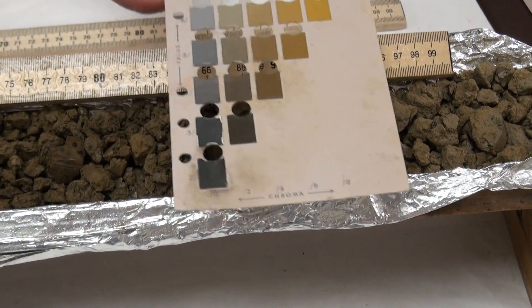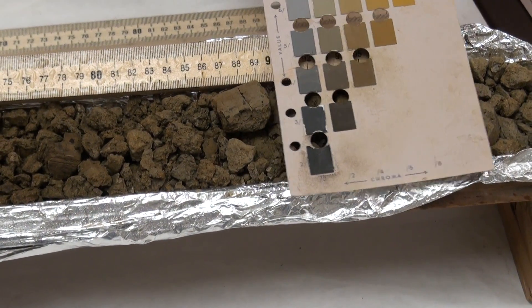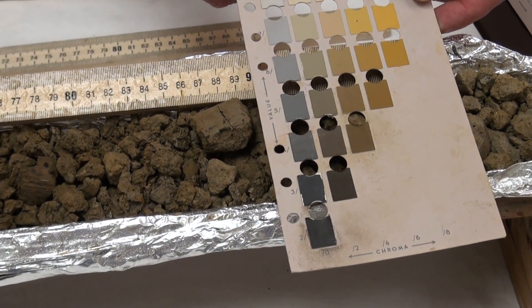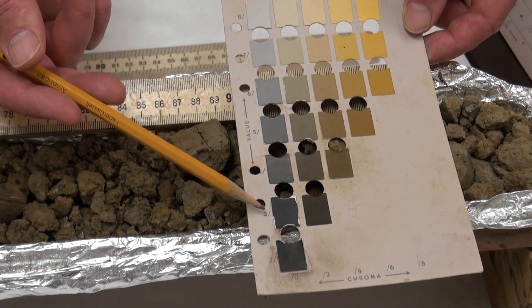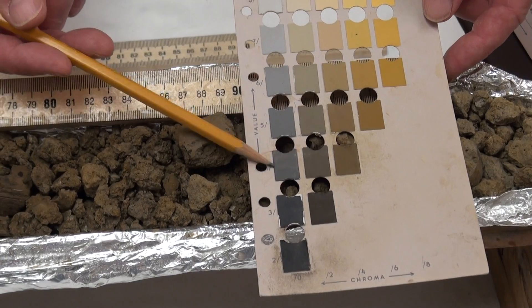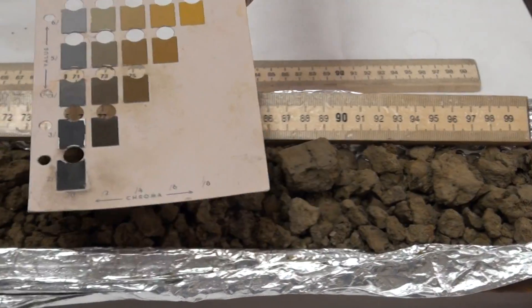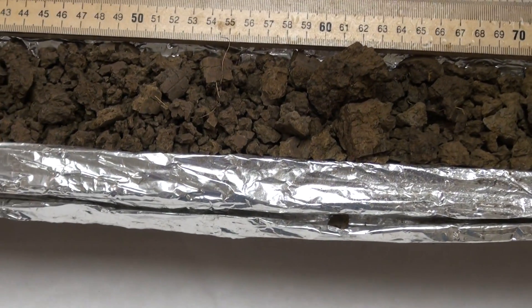How does that change our colors? They're darker, so the value will be lower, and I think our hue is still pretty good here. I'm thinking 2.5 Y, value 4, chroma 4 — kind of in between these two values. I'll let you make the call. Okay, moving back up to where we were previously, about 60 centimeters. Let's get this wetter.